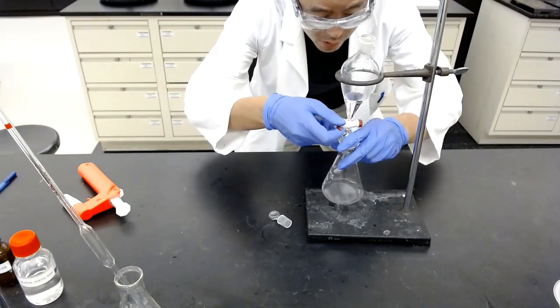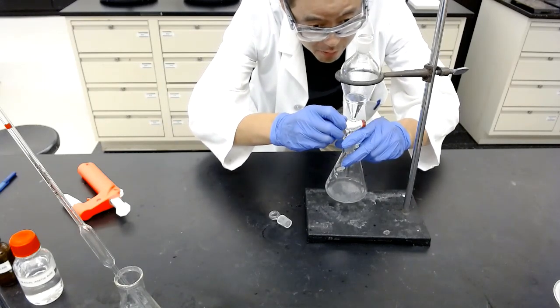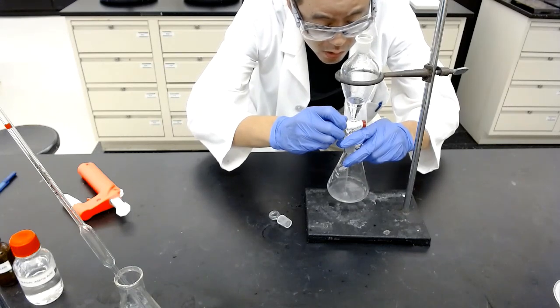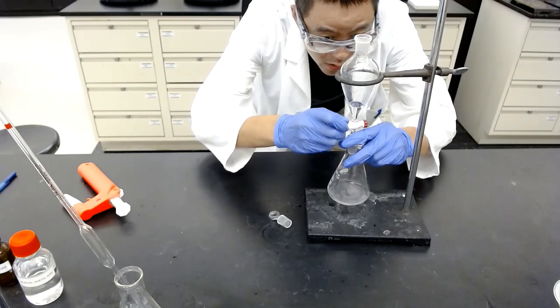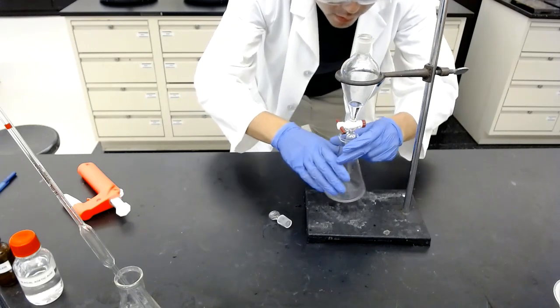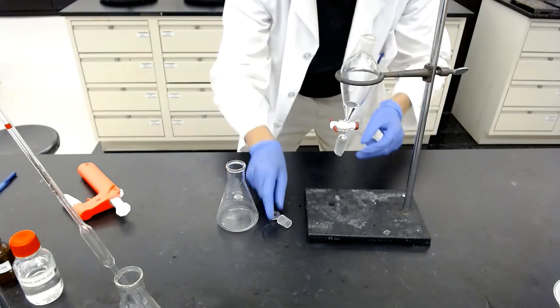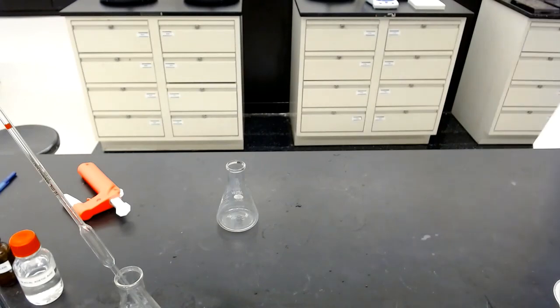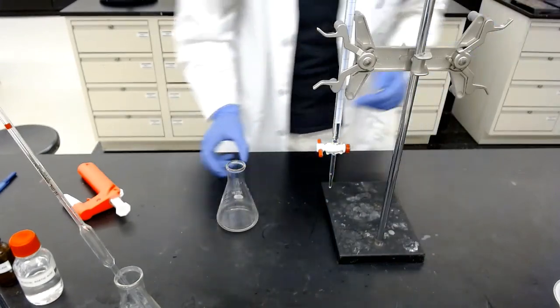Settling should be done now, so we have a fresh Erlenmeyer flask. Start collecting the bottom aqueous layer. Alrighty. Now this separatory funnel job is done for now. Then we'll move on to do the third titration.